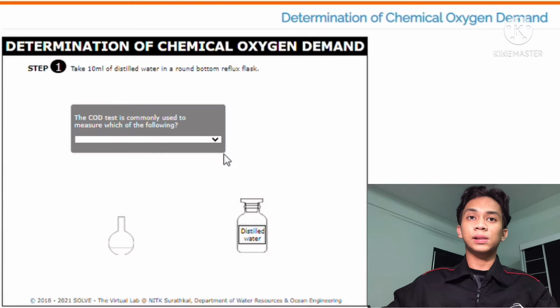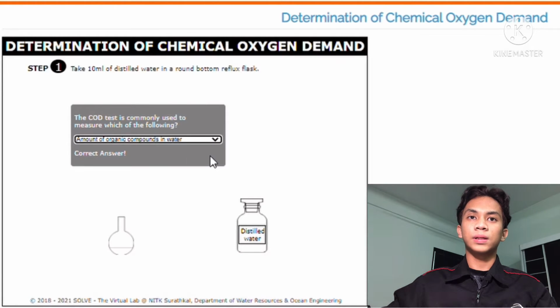The COD test is commonly used to measure which of the following? The answer is amount of organic compound in water.